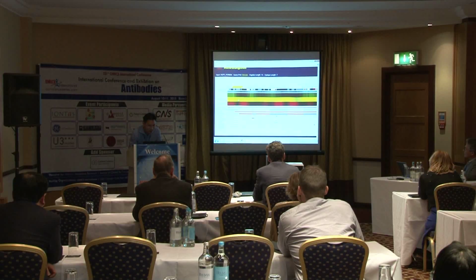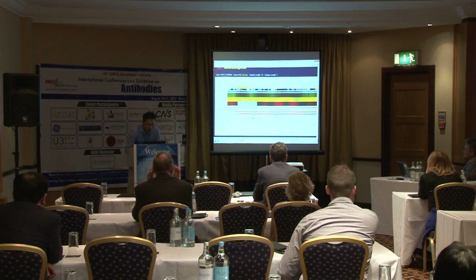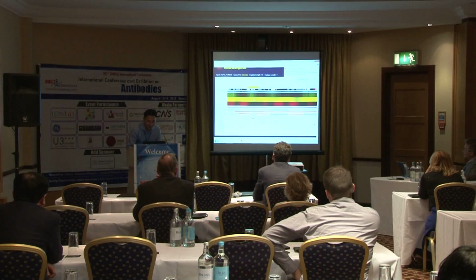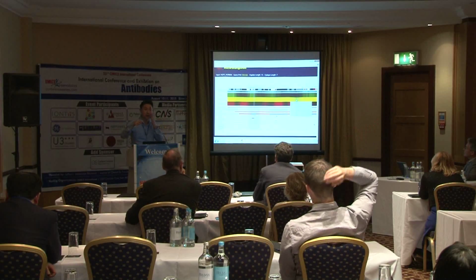So this yellow highlight here marks the peptide of interest, and down here you can see the multiple alignment. In this case, let's say this peptide has some overlapping sequence with other proteins, and this will show up along the whole sequence. So this is a helpful feature, so you can pick the area that would be more unique.